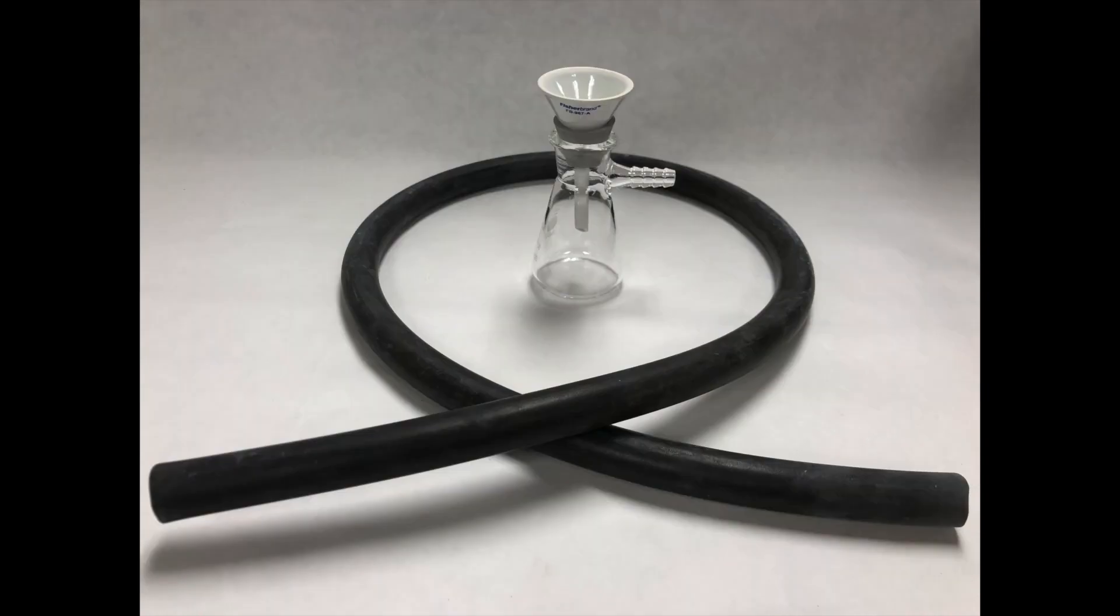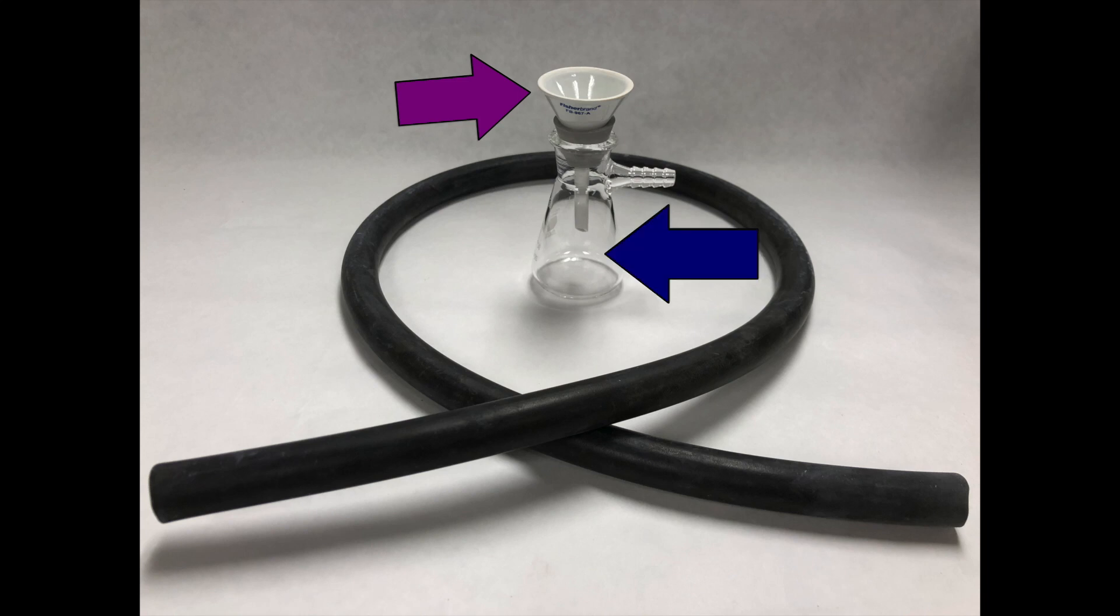Your vacuum filtration system is made up of three main parts: the Hirsch funnel on top, the 50 milliliter filter flask which holds your filtrate, and the vacuum hose.